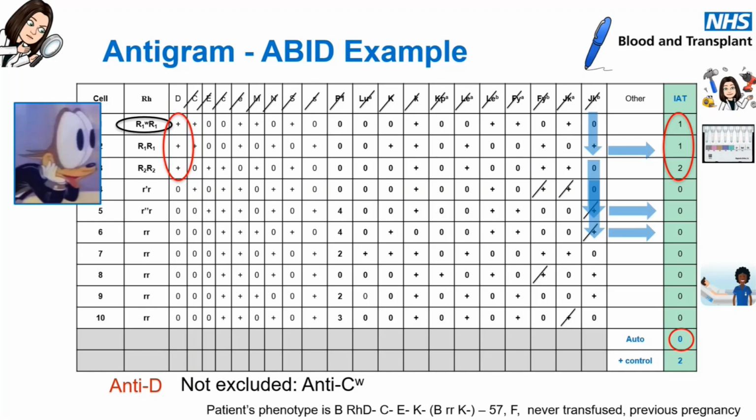But on this one, I can't. So I have to continue on down to the next positive, move along. There we go, that's negative. Great. I get my pen and I strike a little line through it. You don't have to do it like this. Some people can just look and they'll see it themselves, but that's just how I do it. Then I move down to the next one, go along.